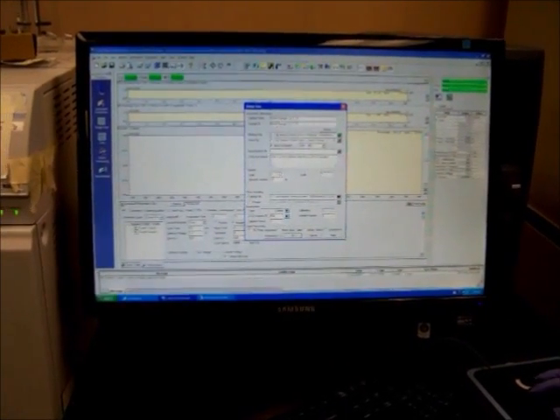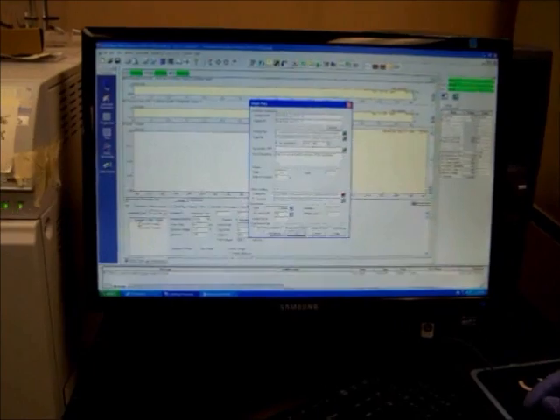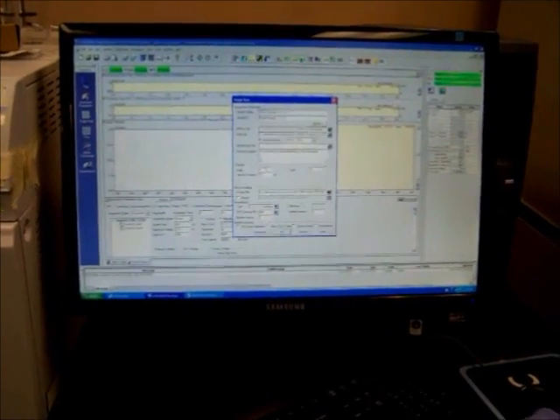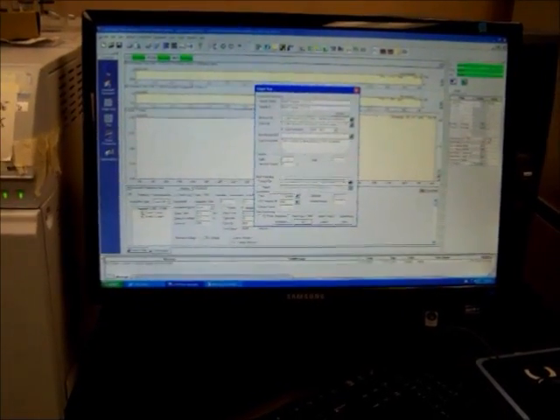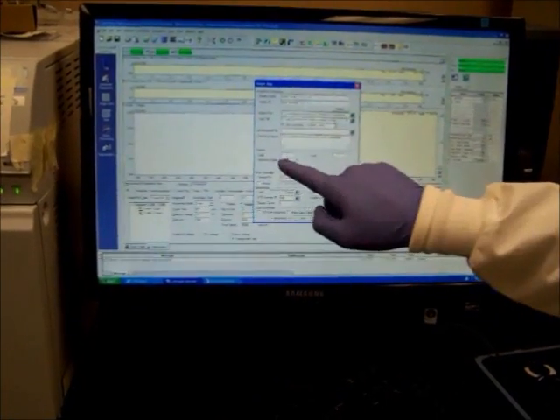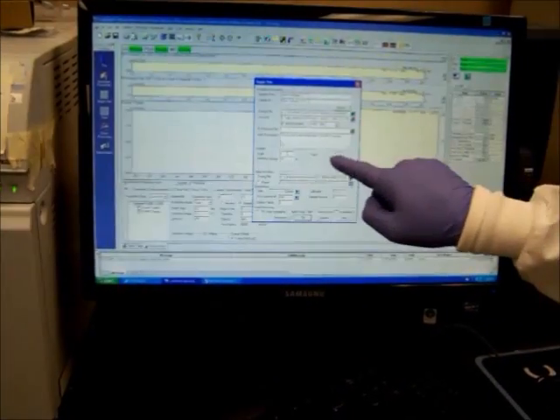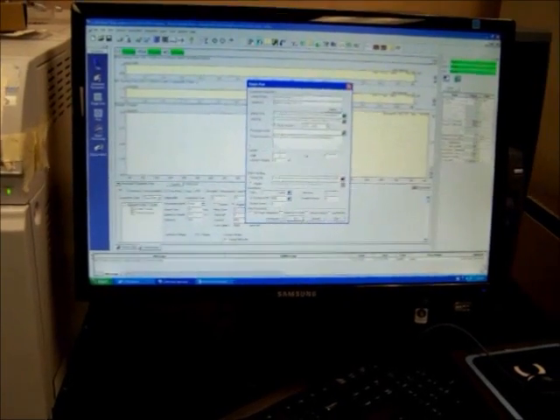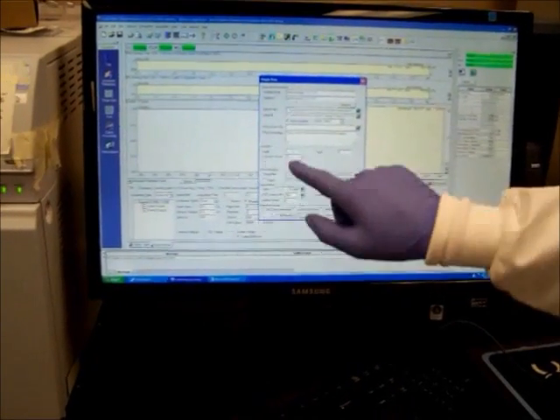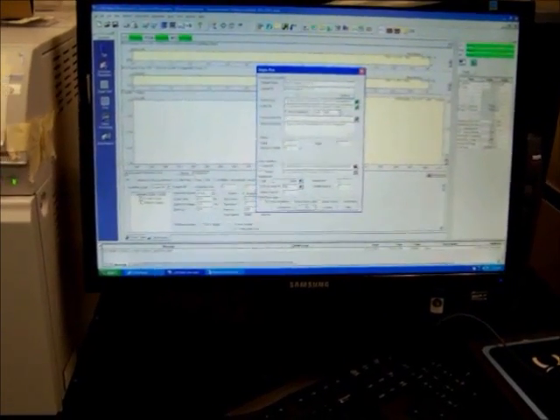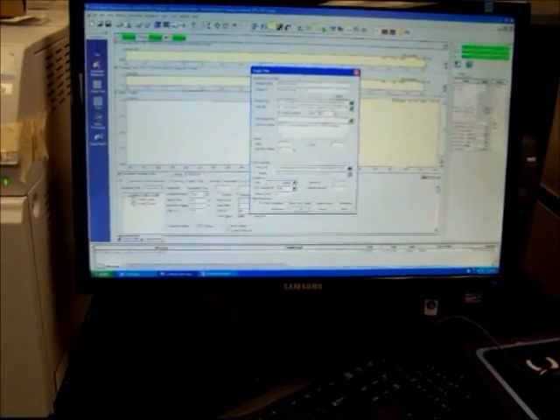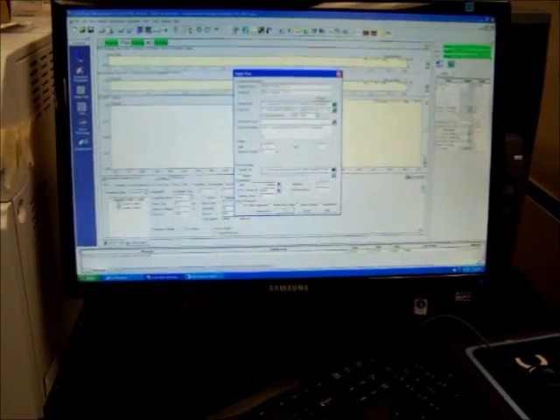Down here you select exactly which vial and which tray you're using. So in this case, vial 1 from tray 1. Select your injection volume. 10 microliters is about a fair bet. If you go below 10, the machine probably will not be able to detect it. So stick with 10.